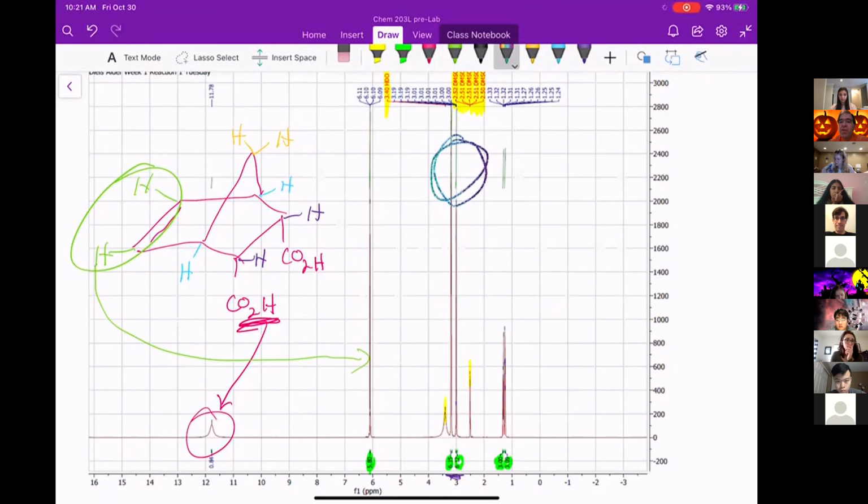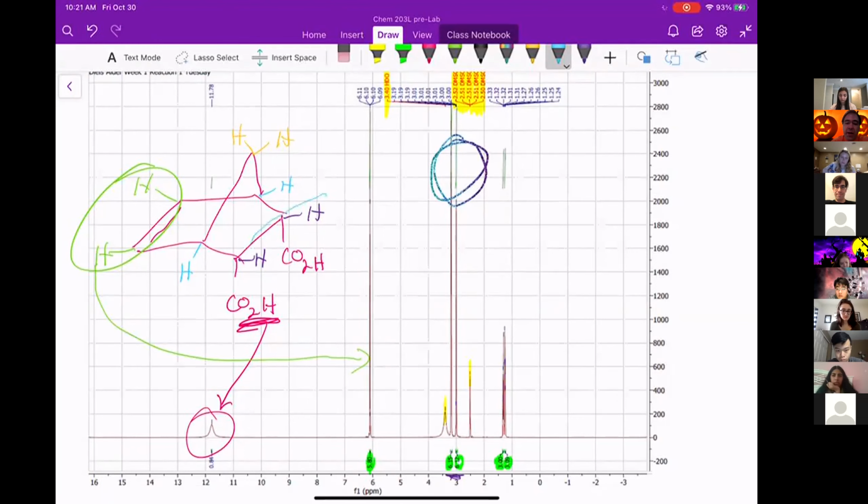And so what I'm going to have to do is use my tools. I'm going to have to use my ChemDraw and my Spartan, at the level that we're at right now, to try to identify these. And it turns out that the purple hydrogens are the ones that are more upfield, and the blue hydrogens are the ones that are more downfield. Again, at the level we're at, that's not a prediction that I would expect you to be able to make. That they're in that region, yes, but not which one's which.